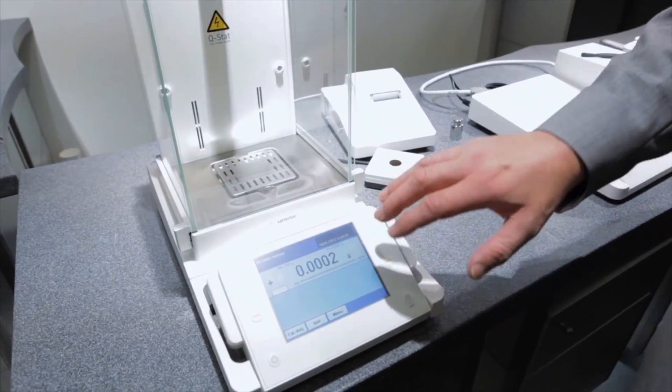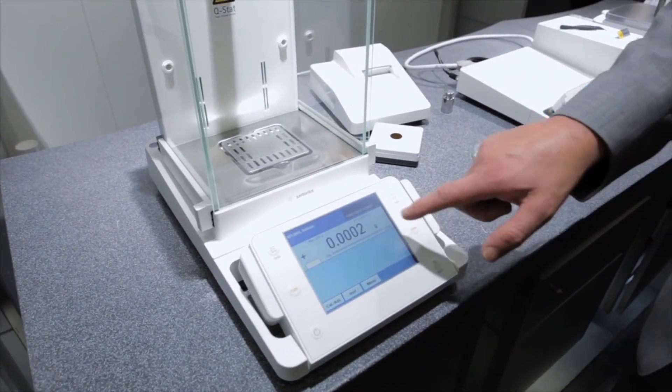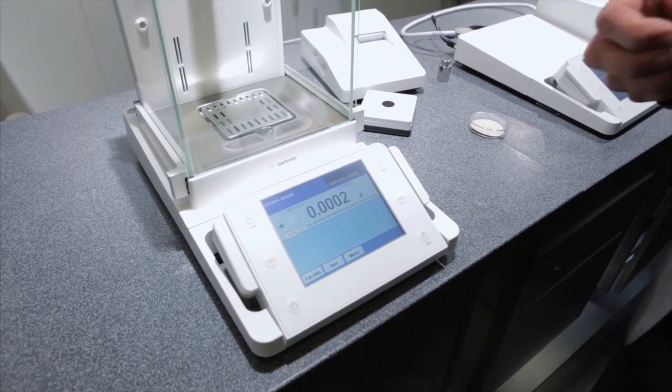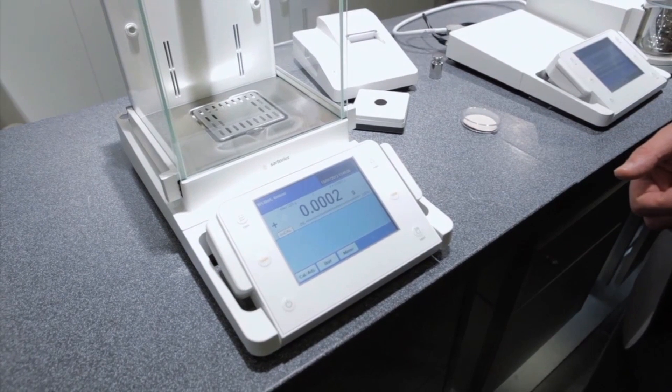It's also possible to take a more standard display which would come with weighing only and less sophistication but more to suit the needs of the user who only wants to weigh but would like to have the perfect weighing results coming from Cubis.